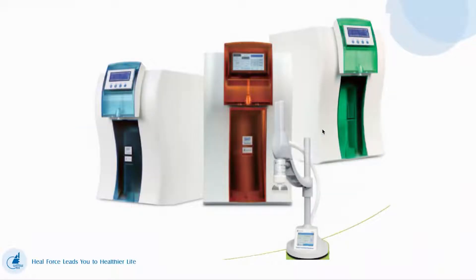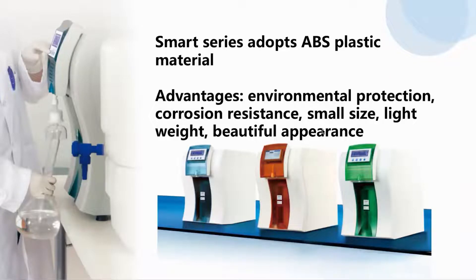The orange color is Smart Plus Series. Blue color is Smart N Series. And green color is Smart Mini. The Smart Series have ABS plastic material. The features include small size, light weight, and beautiful appearance.